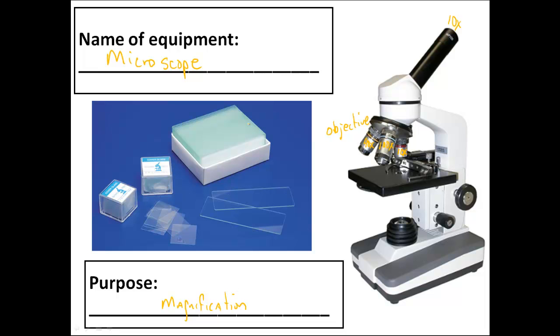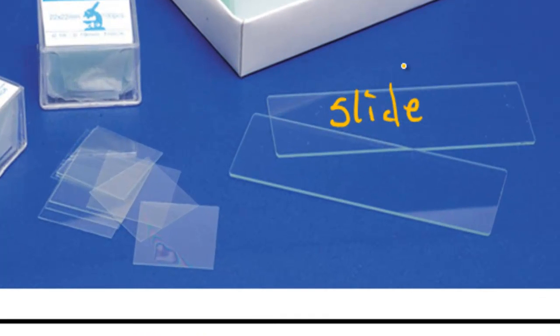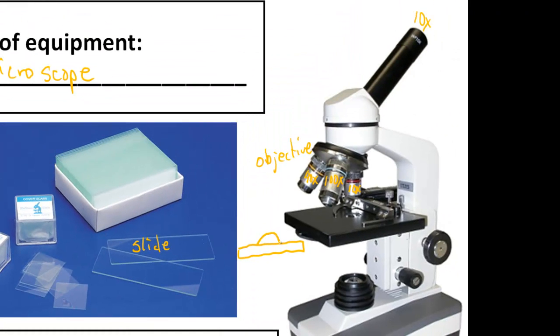Magnification. For that, you usually use a slide, usually made out of glass. Slides, and then again, going back to that property of water, you put a drop of water with samples in it, and that water is going to look like this, which acts like a lens, and the light going through different places can actually mess up your lens.